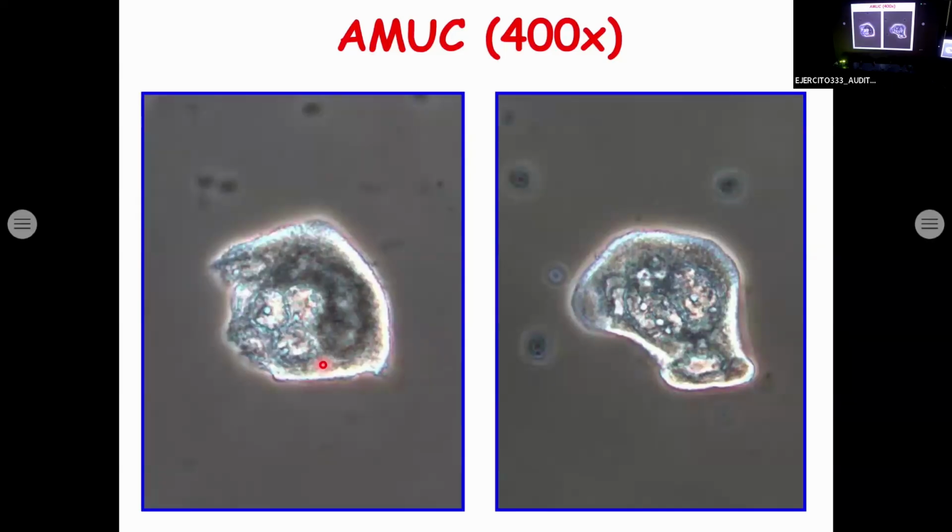To me, it is a Trump-like cell. Is that true? There is no Photoshop. It is. At that time, Trump was not yet president, so not Photoshop. Is it true, no? Okay.